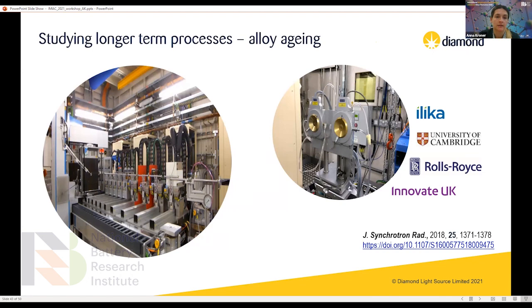The idea is to store the reaction in situ for a period from a few months up to a couple of years, and then perform the X-ray diffraction measurement just once a week. So for this extended period of time, that gives very important information for scientists to see the deactivation of the specific material or behavior during the charging and discharging.